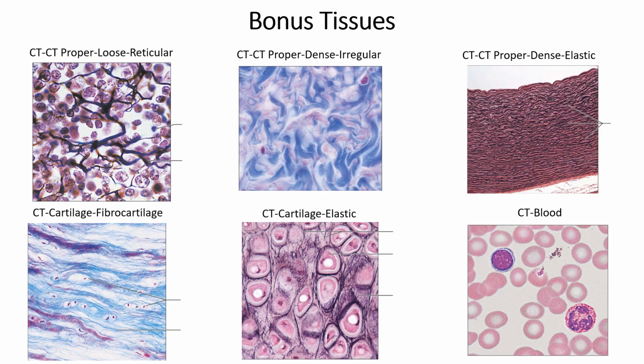And this time those white spots inside are showing us the cells within the lacunae, right? Notice the spiderweb looking fibers in here. Notice that they look kind of like they're coiled or kind of stretchy. So think about that and think about elastic, right? They look similar in shape to the elastic fibers that we looked at for dense connective tissue proper.